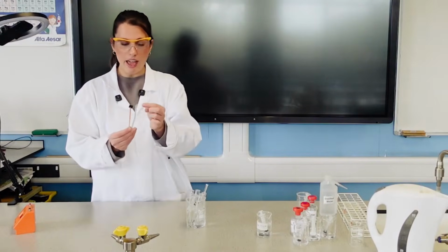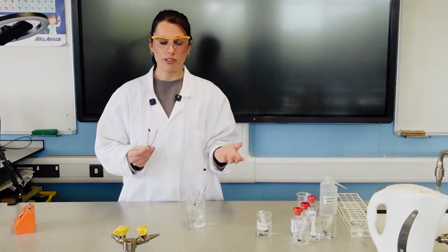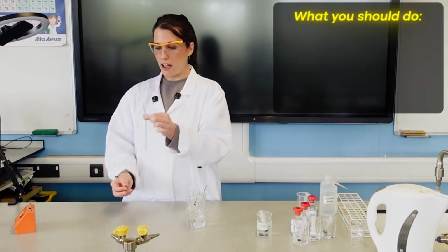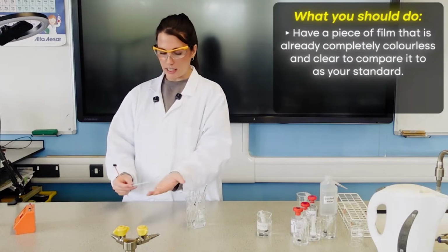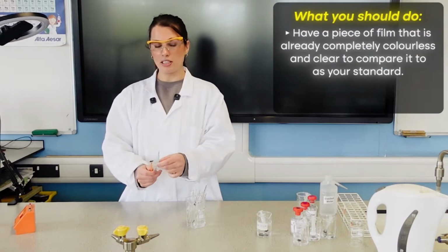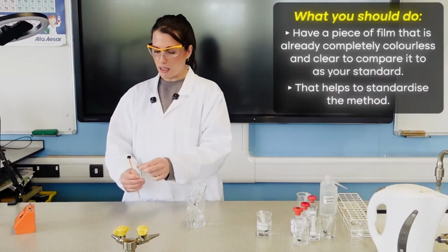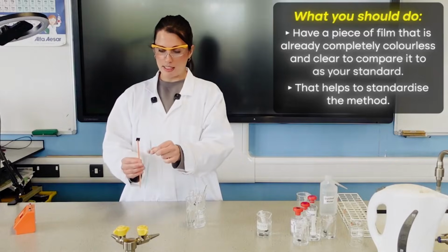And because that is subjective, when I think it's completely colorless and clear, it might be different to someone else, what you should do is have a piece of film that is already completely colorless and clear to compare it to as your standard. And that helps to standardize the method. So that's what we are doing here. That's why I've got these 2 bits at the ready.